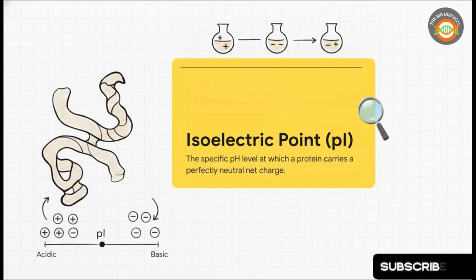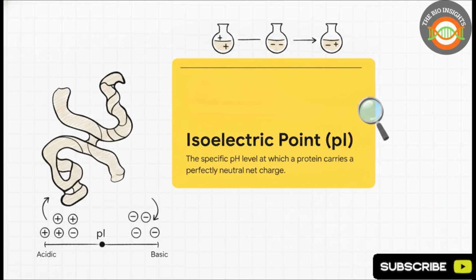Okay, on to Section 4, ion exchange, or catching charges. This concept here is absolutely foundational. As you probably know, proteins are made of amino acids, right? Well, their net electrical charge actually changes depending on the pH of the liquid they're floating in.